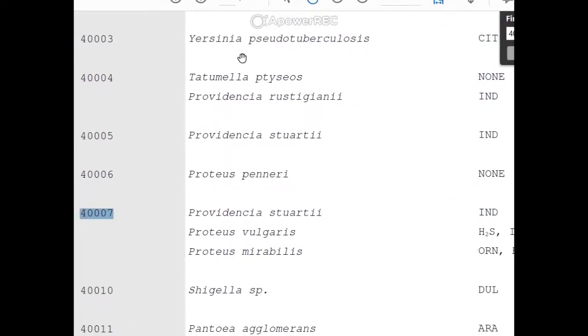Okay, finally what you're going to do is take this code over to the Enterotube code book, and do a Control F to do a find. Type your code into the little find box and hit enter, and you're going to find what code links to what microorganisms. Many of them will have a single code for a single bacterium, but sometimes it doesn't provide any better narrowing down than 2 or 3 different microorganisms. If this happens, for your answer, you will just provide the code number you have and the 3 different microorganisms that are listed.